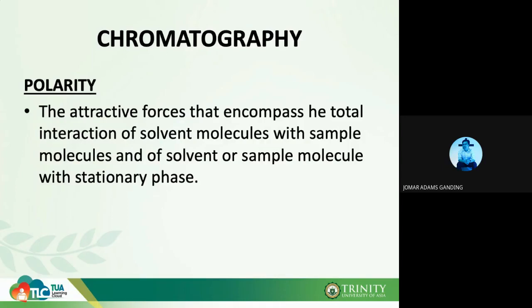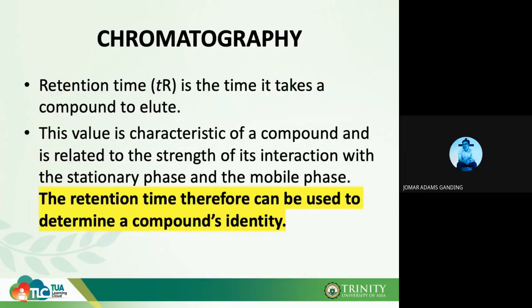Sir, now that they are separated, I want to identify them. How can I identify them? You can identify them by identifying their retention time. Retention time, you have a formula there. Retention time is the time it takes for a compound to elute.